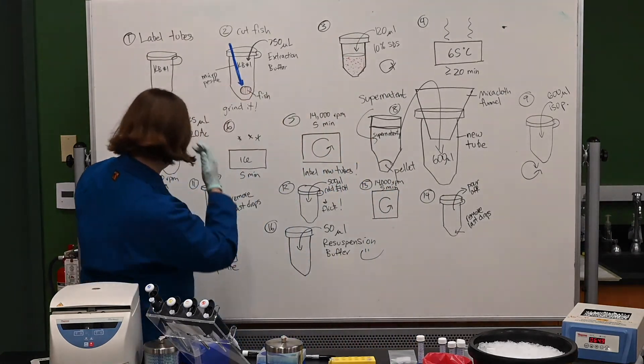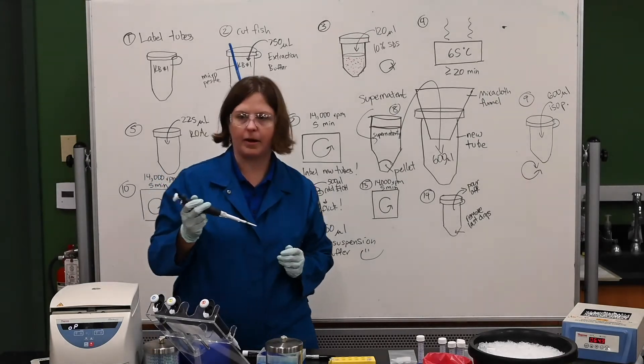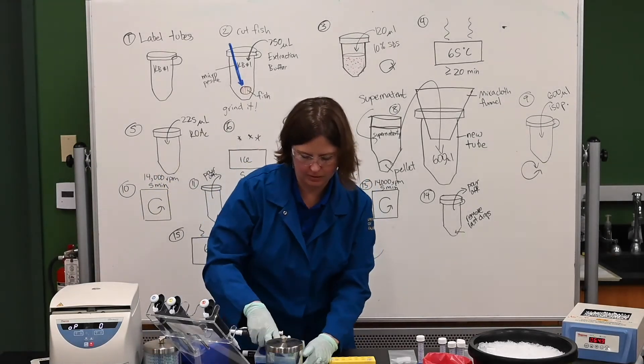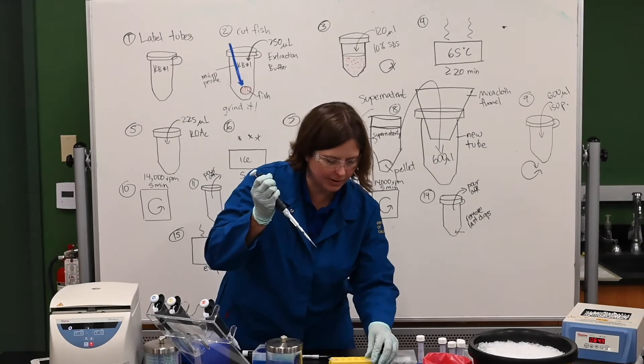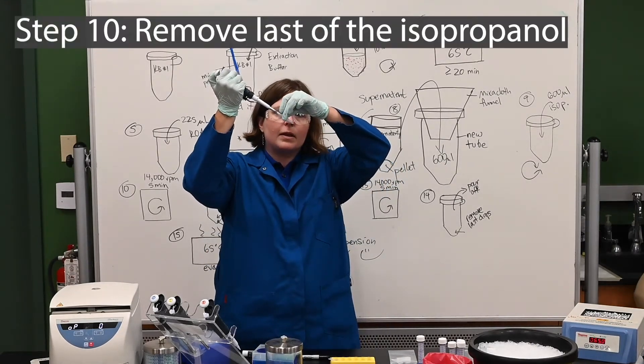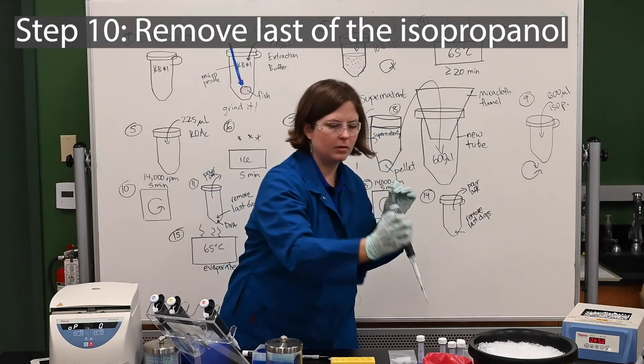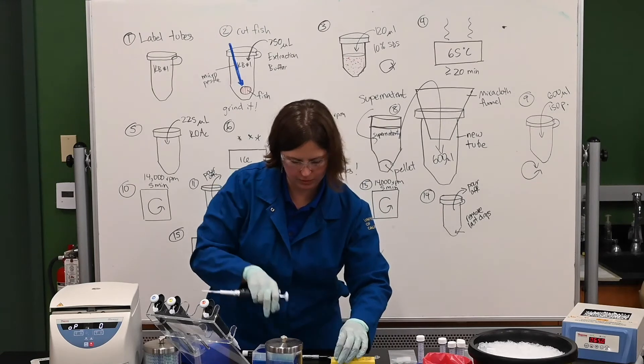So now it says I should remove the last drops using my smaller pipette. This is a P20, which is going to be tiny amounts. So if there's any alcohol still in there, we'll get that out. Like so. The other one too, just to be complete.